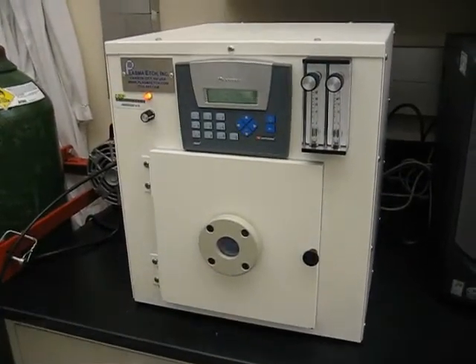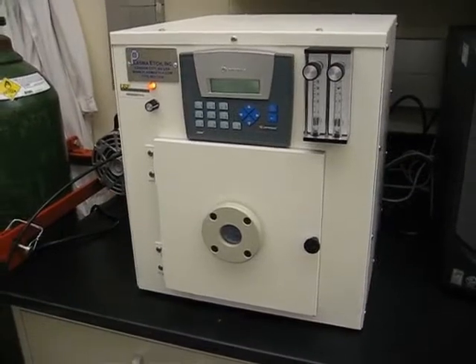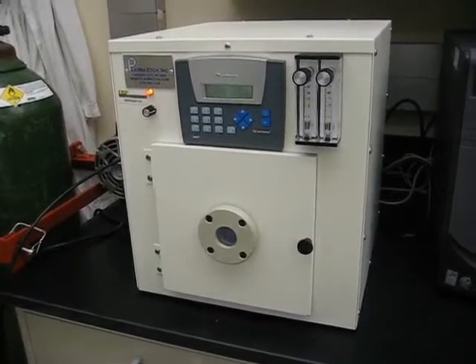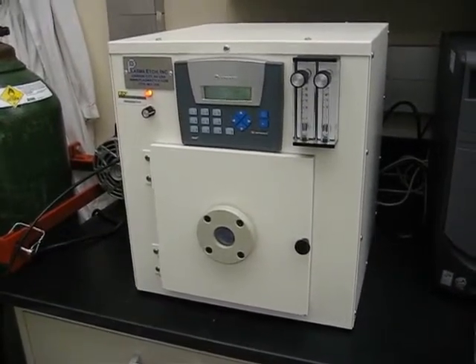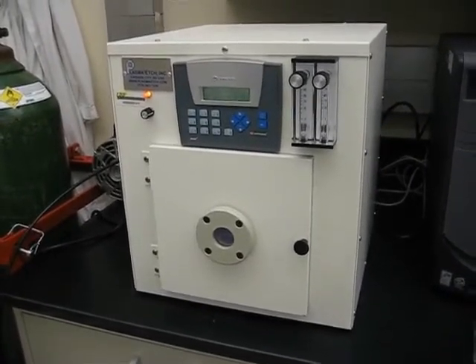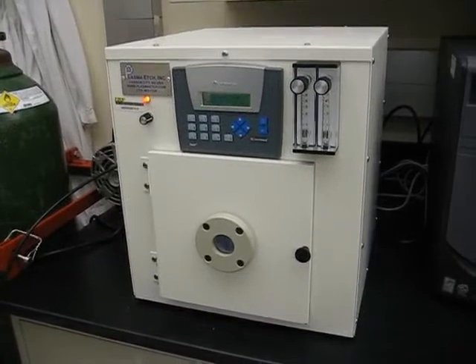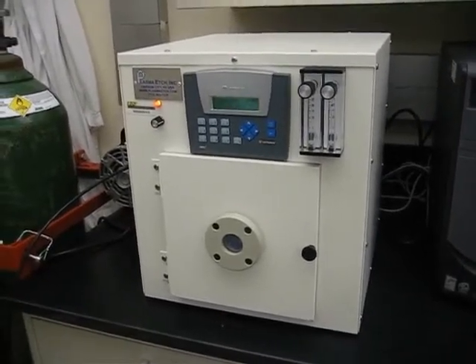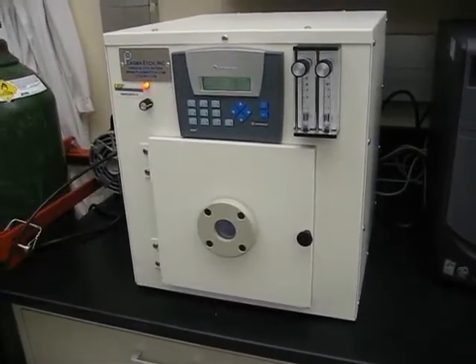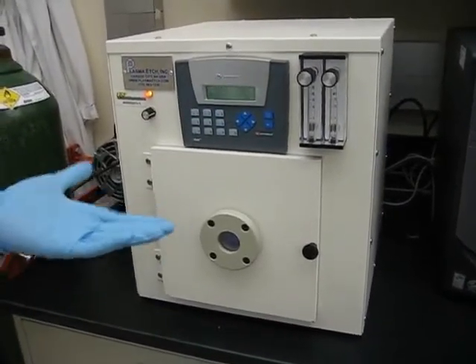This is very important in my process because the depositions are very, very thin. On these glass cover slips, I deposit 10 nanometers of titanium and 20 nanometers of gold on top — a total deposition of just 30 nanometers. So the glass cover slips must be really clean of any organics or particles. Even a slight organic layer causes the gold and titanium to delaminate from the cover slips during my micro-contact printing process.